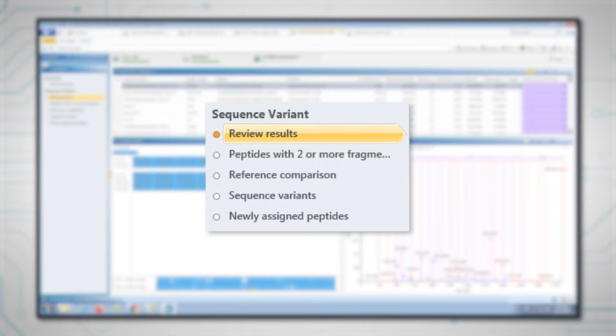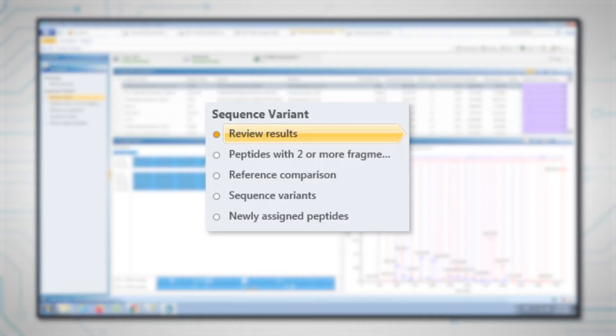It allows us to look at a reference comparison between the two digests to identify which peptides are the same between the two molecules and which have differences. Then we have a sequence variant step which will allow us to elucidate the differences between the two molecules, and then the final step will focus on the newly assigned peptides.